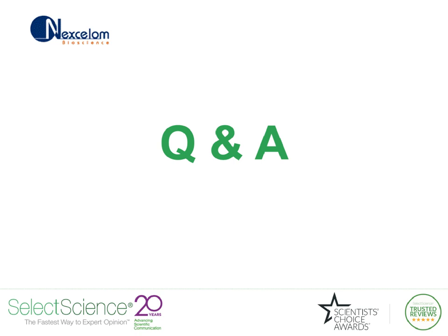Great, thanks, Leo. Lots of great questions coming through. On here, we love our K2, that's great. In our CAR-T process, we find that cells that are cultured for 6 to 8 days don't take up AO very well. Have you observed that as well? And any guess as to the physiology that drives that process?